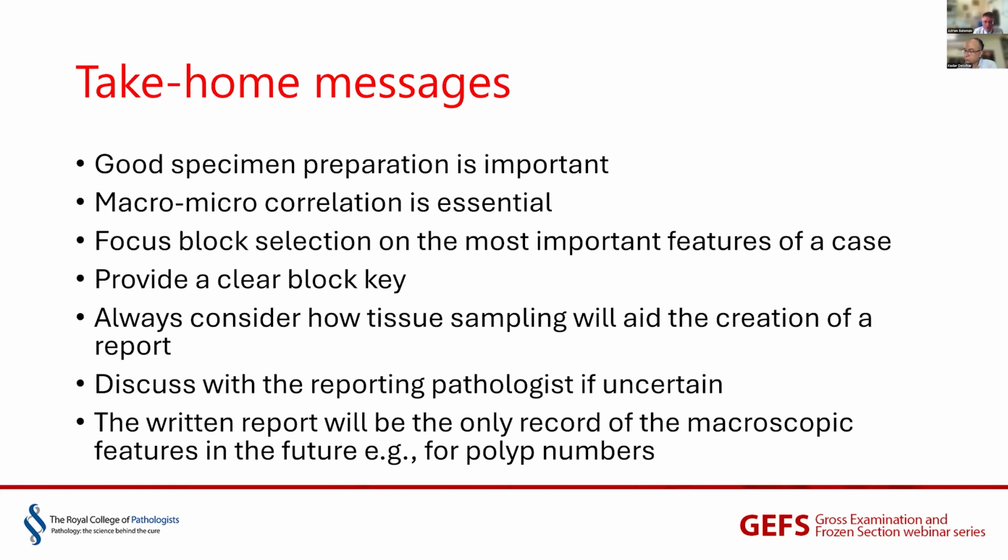And just bear in mind that long after the slides and maybe even the blocks have been discarded or are just not available, the written report, your macroscopic assessment and the following microscopic assessment, may be the only record of the patient's specimen and their diagnosis in the future, particularly, for example, with things like polyp numbers.